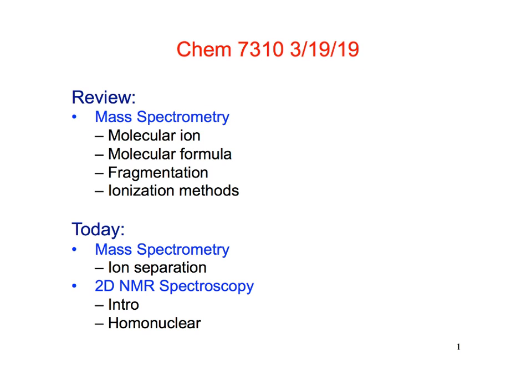spectra that were generated using electron impact ionization. So the Friday before spring break, we talked about some other ionization methods, and any of those ionization methods can be paired with different ways to then separate and analyze the actual ions that are formed. Okay?